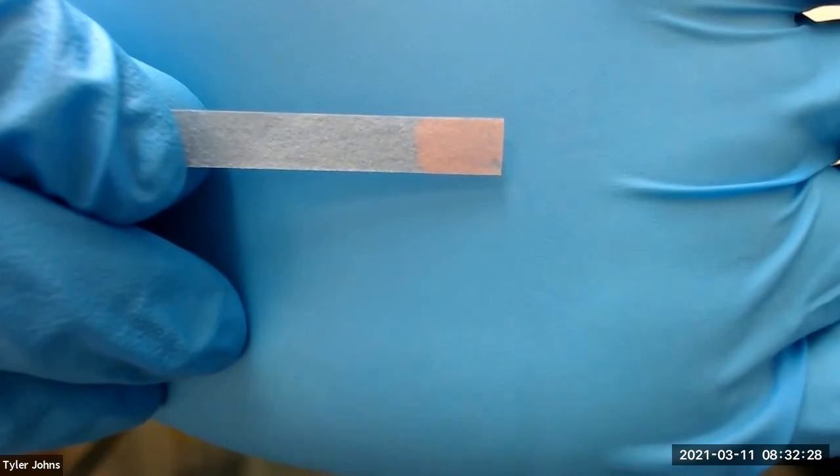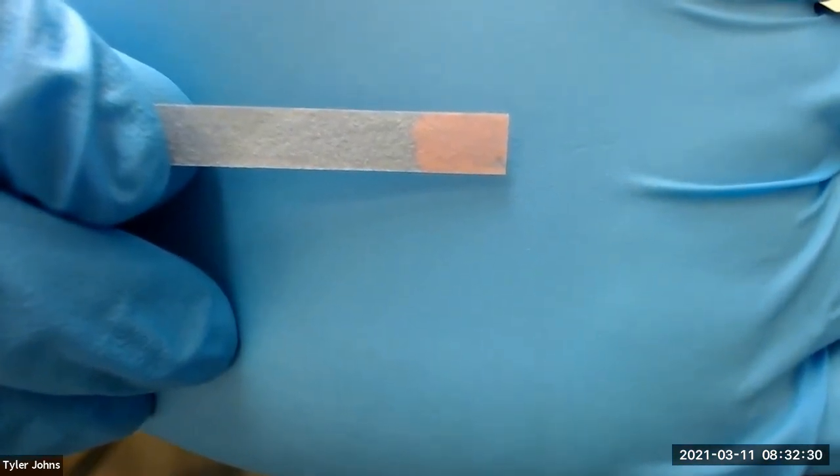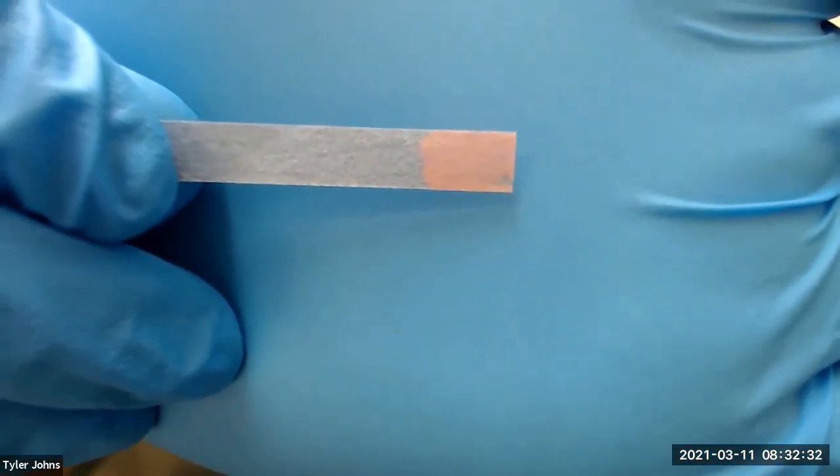The solution has turned the blue litmus paper red, indicating that the compound is acidic.